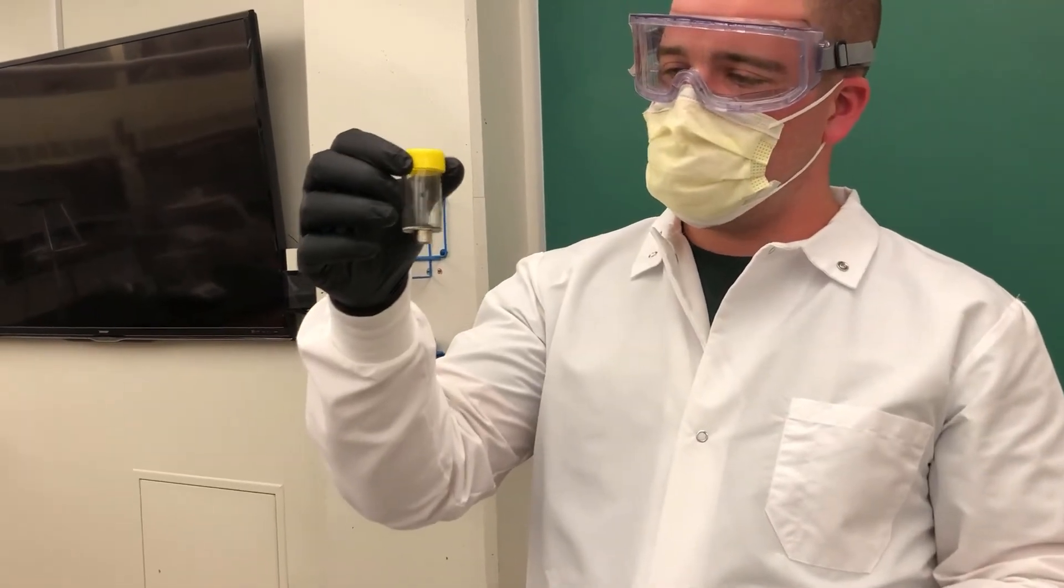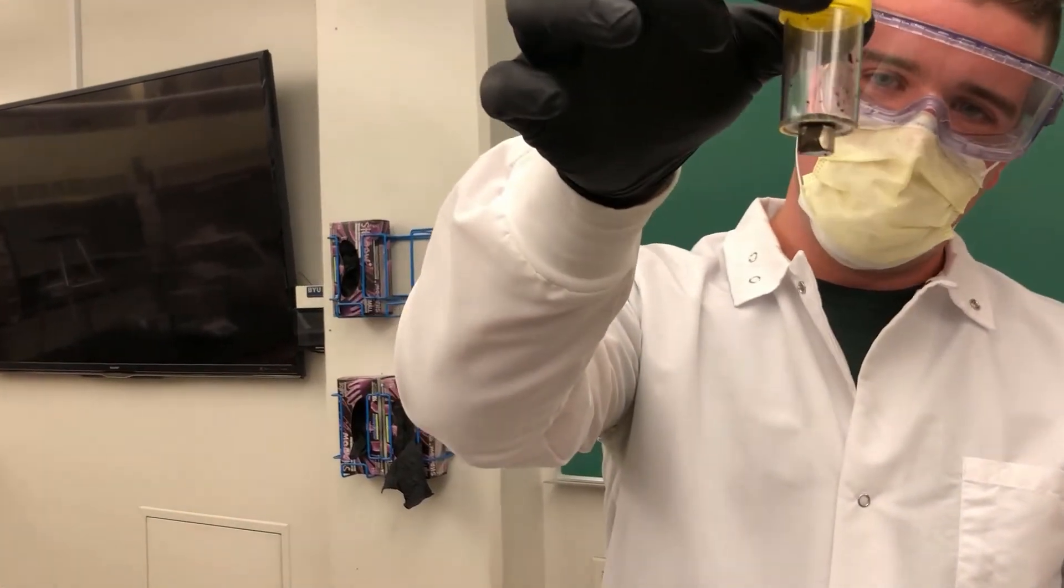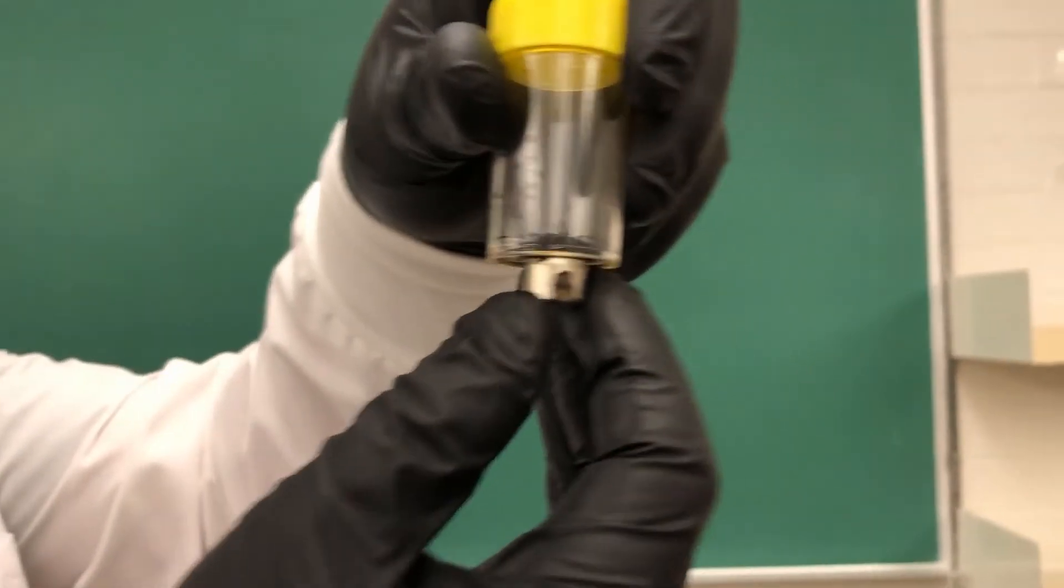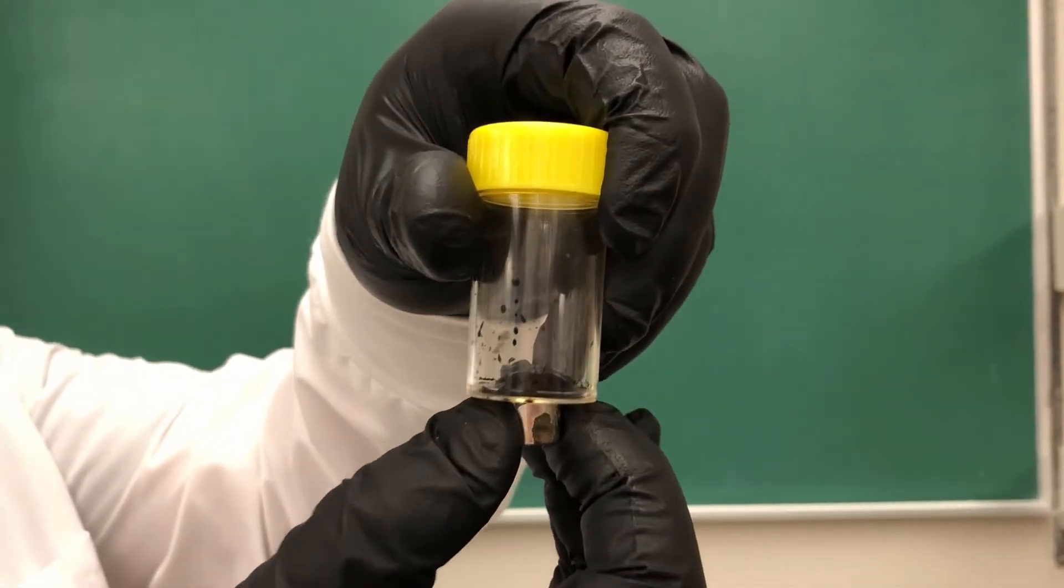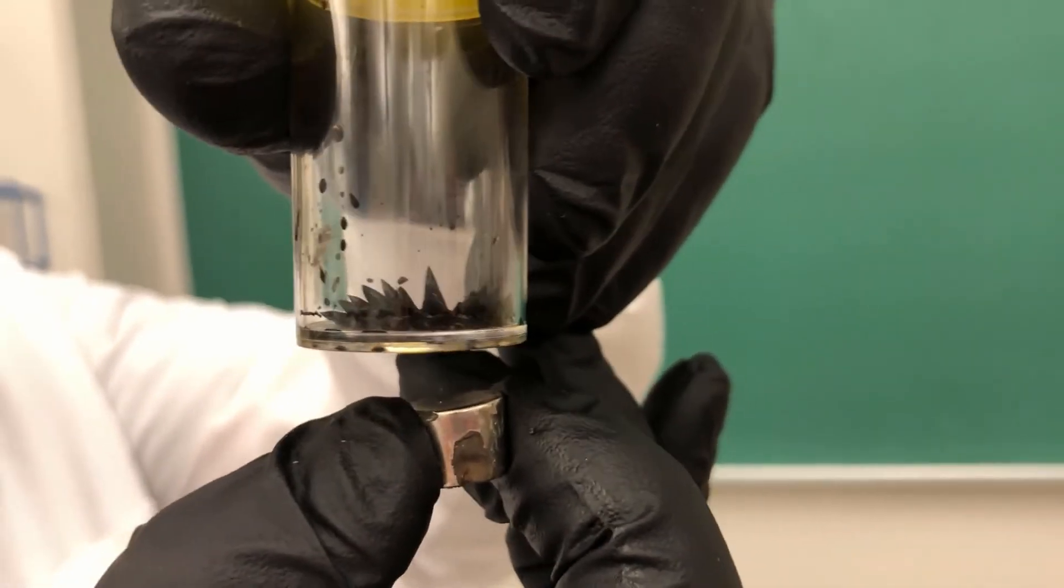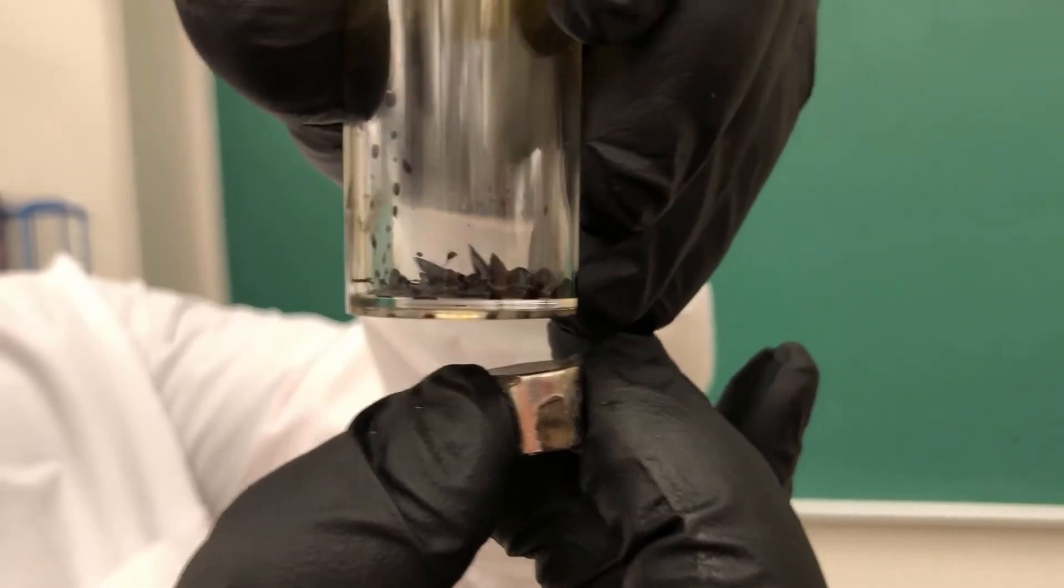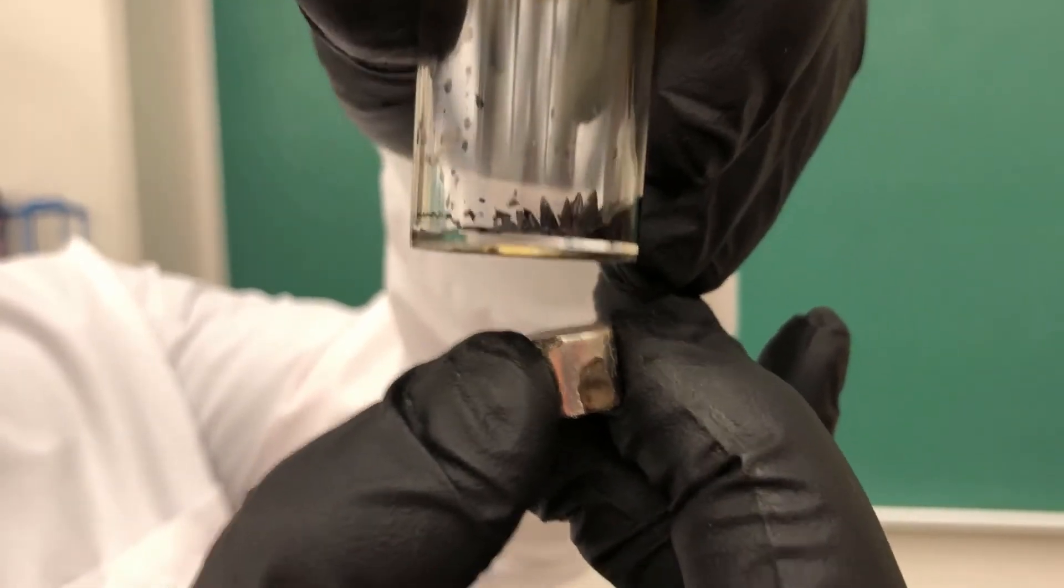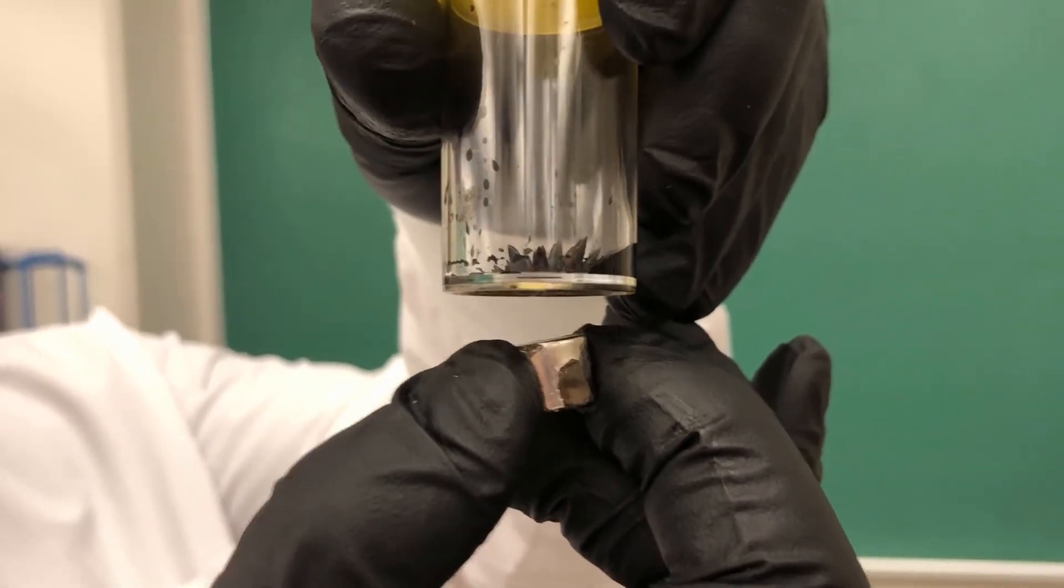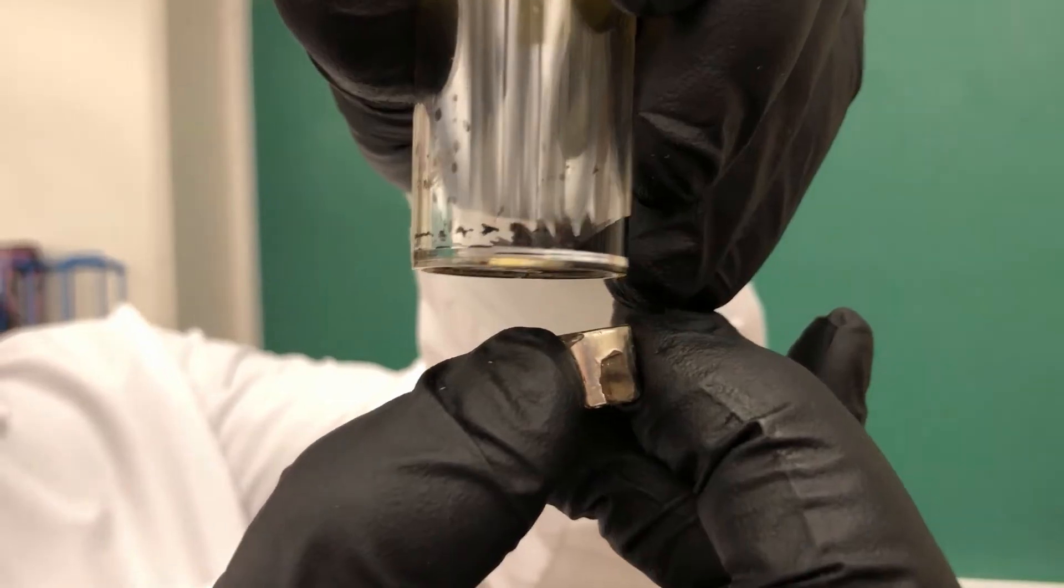Okay. So as you can see, we've completed our ferrofluid as you can see here. It doesn't look like it's doing much but if we hold the magnet about a centimeter under it, you can see it starts to form spikes and it changes as I move the magnet. So that's pretty cool.